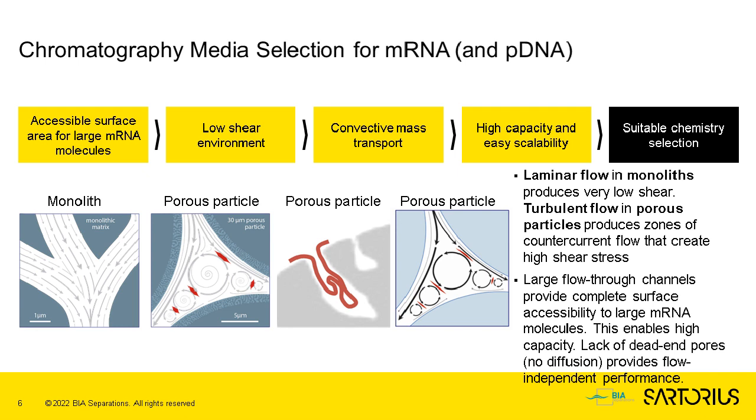One is the small size of the pores into which a molecule as large as mRNA cannot easily enter. The second is that linked to the large size is the low diffusion, the slow diffusion of this exceedingly large molecule. And even if the pores on the porous particles were large enough for the mRNA to enter, the diffusion into those pores would be very slow.